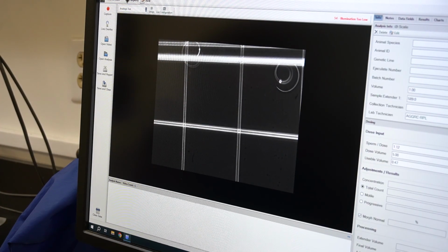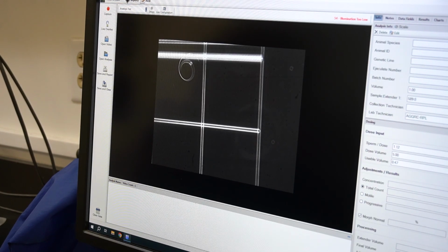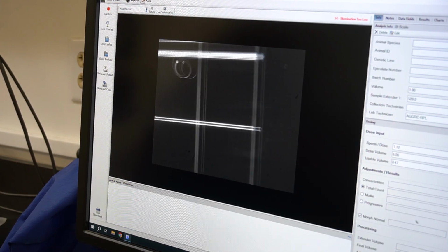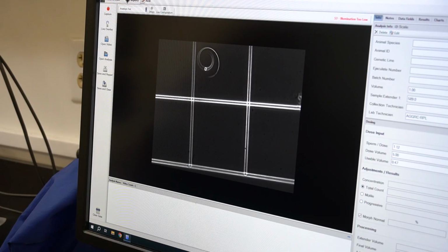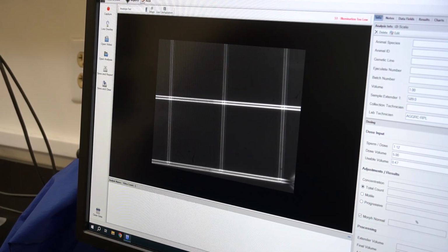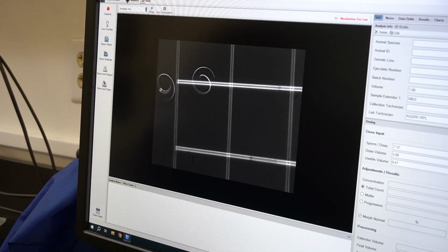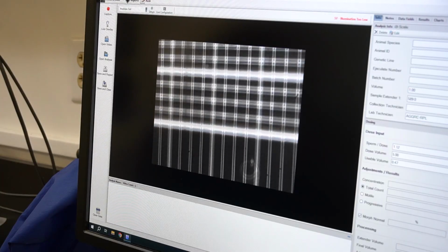Here, this is our bottom right. We have just 1, and this one, we have 2 more. So 3 in that one, and then in this bottom left we only have 1.